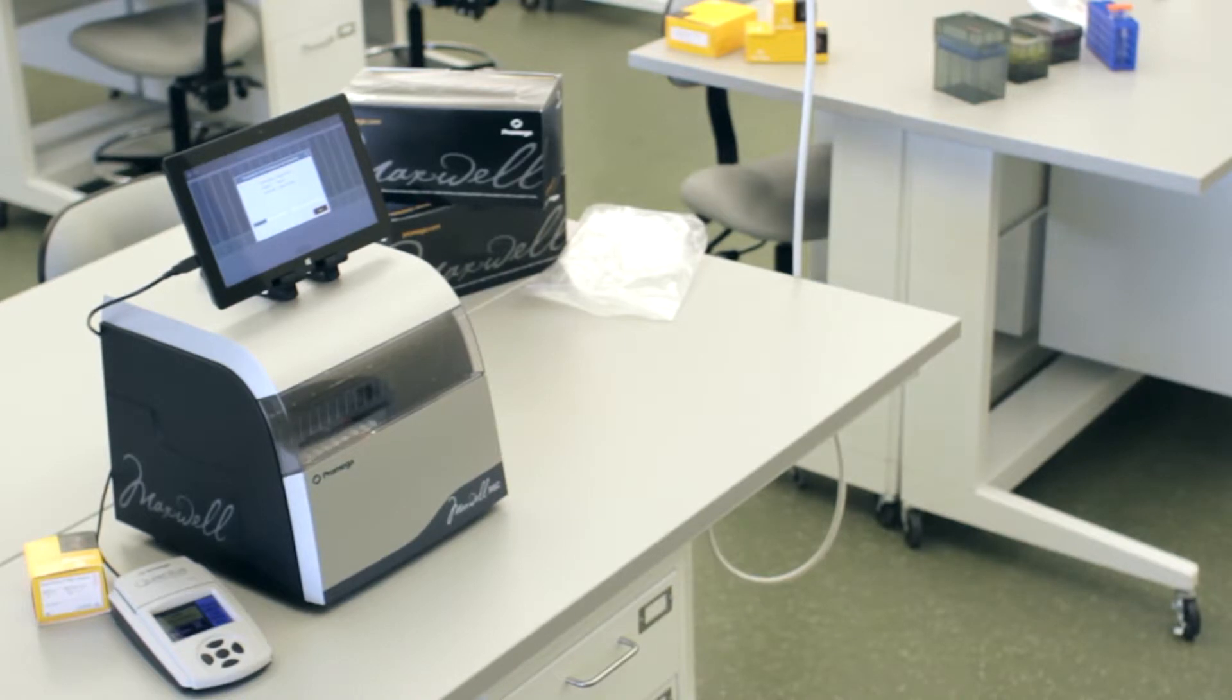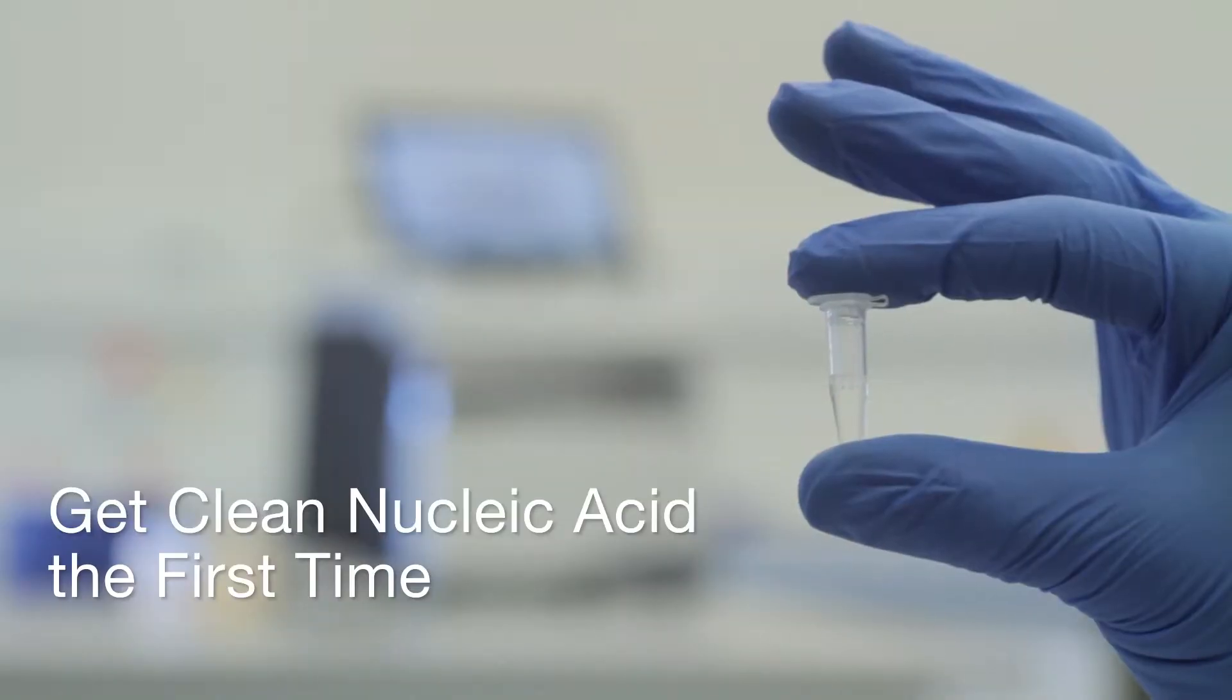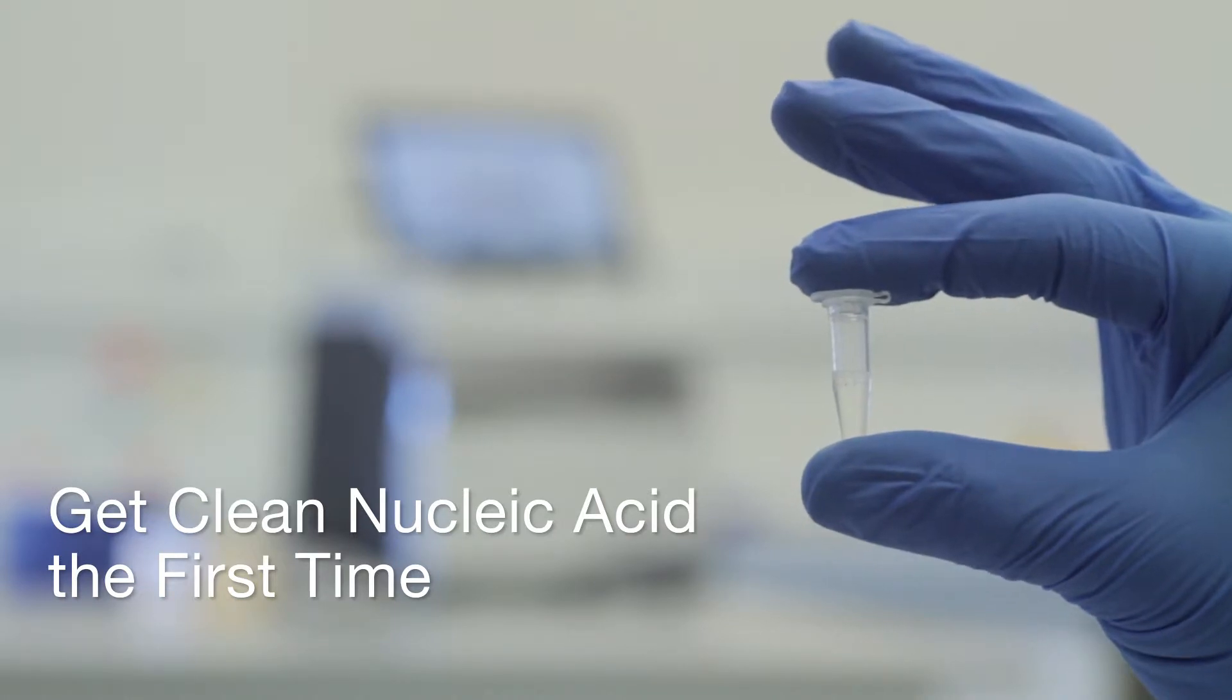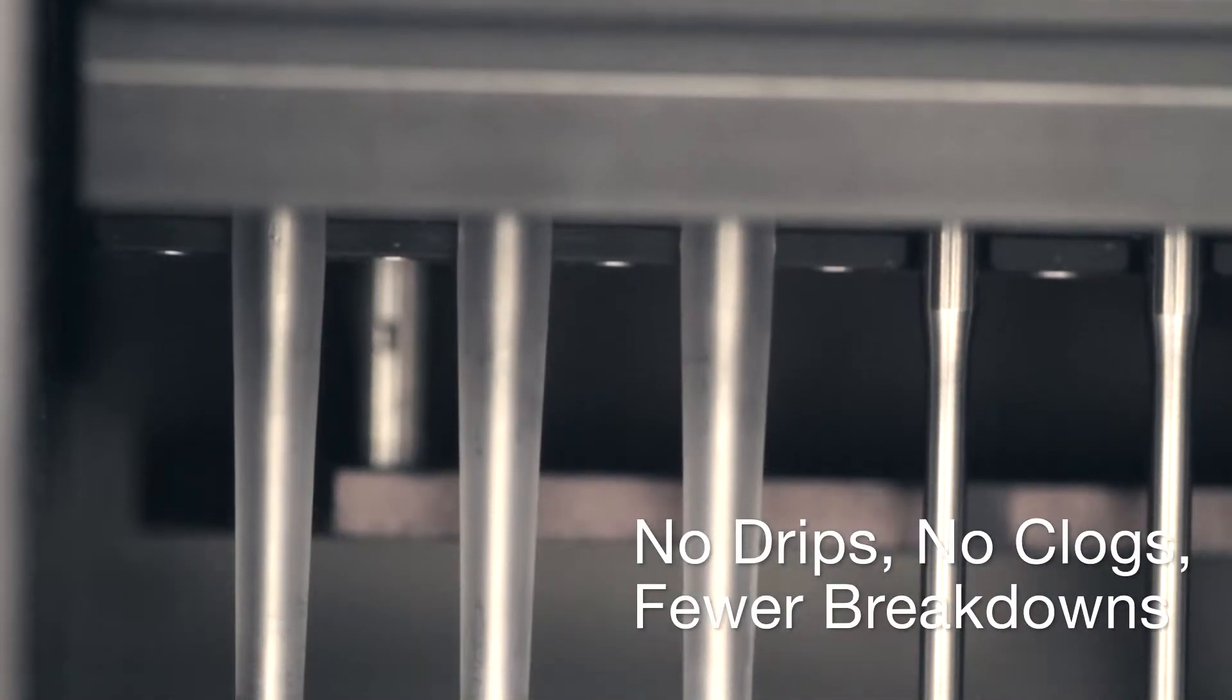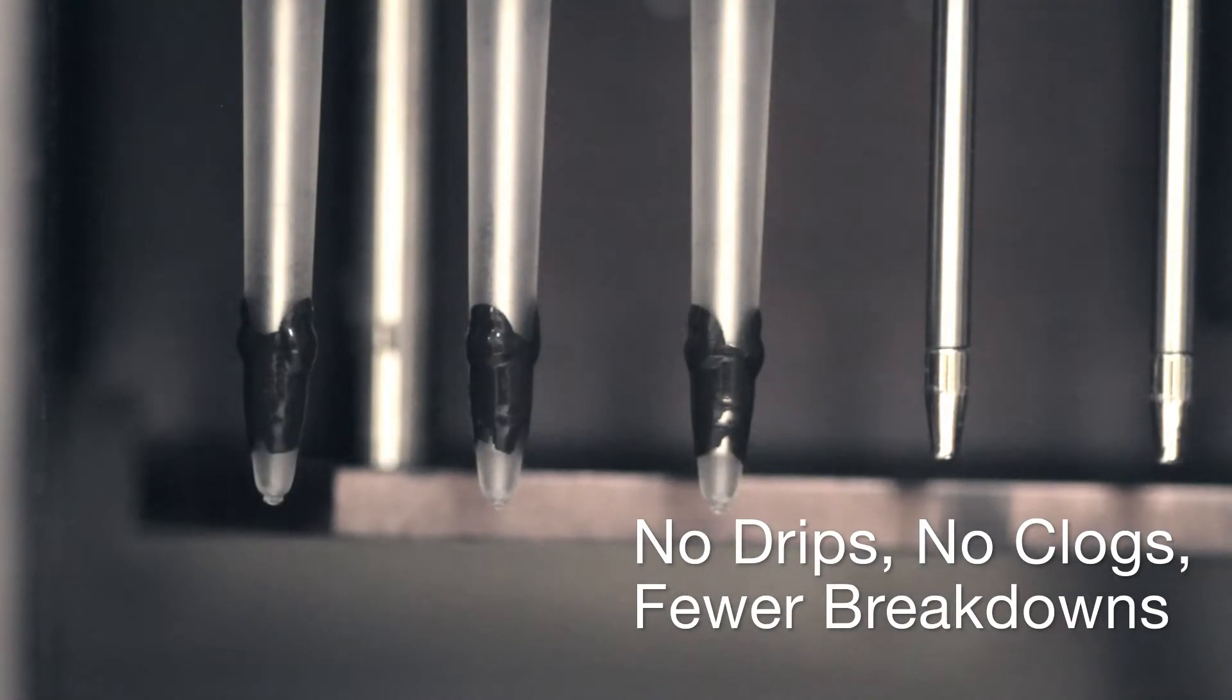The Maxwell RSC system is designed to be extremely reliable and to consistently isolate high-quality nucleic acid. The novel paramagnetic particle workflow means no drips, no clogs, and fewer breakdowns.